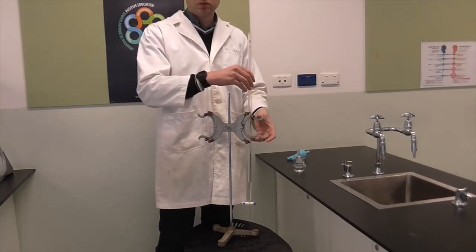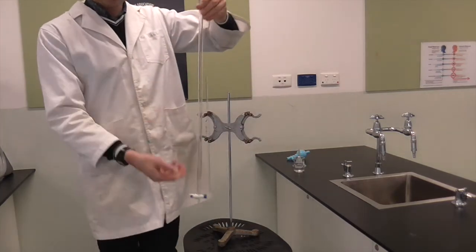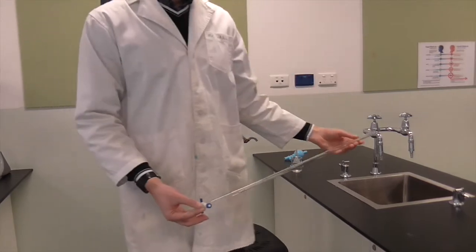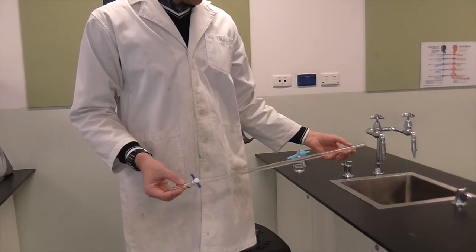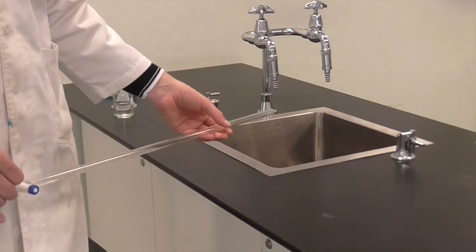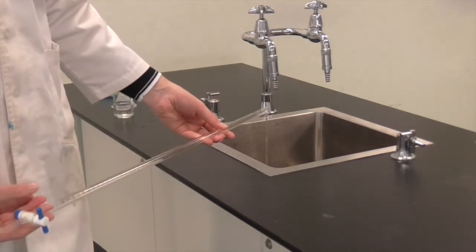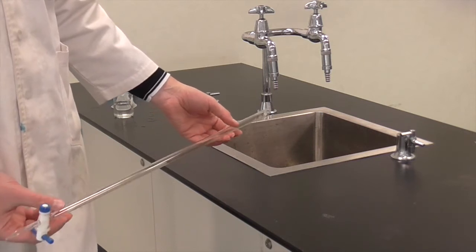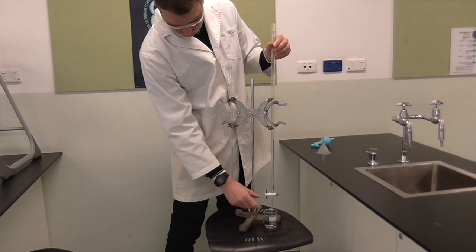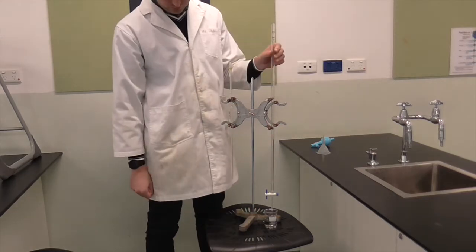Now we're going to take the burette out and carefully tilt it on its side and rotate the burette. While we're doing this, make sure the end of the burette is over a sink so if any solution comes out it will go down the sink. Then we're going to put the burette back into the burette clamp and drain out the remaining solution. This process needs to be repeated again with the solution to be used to prevent dilution.